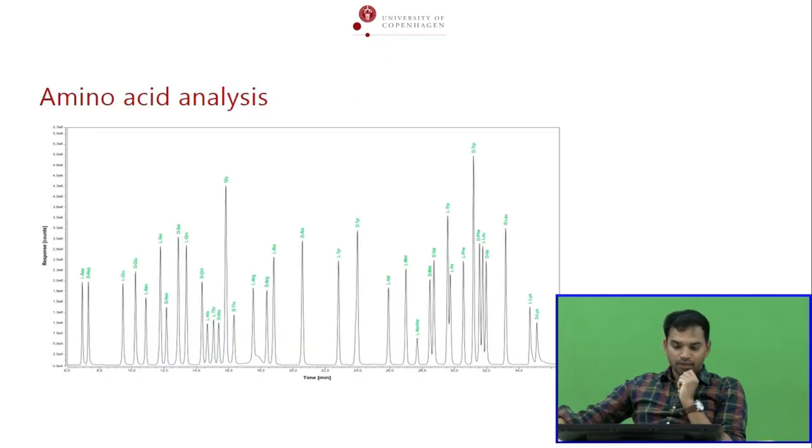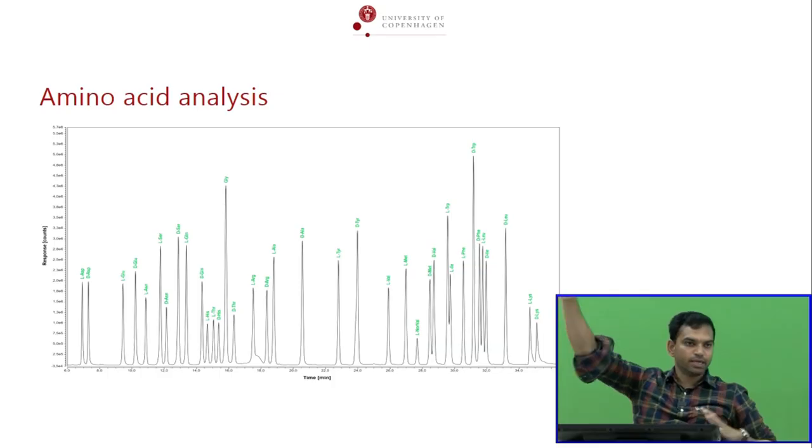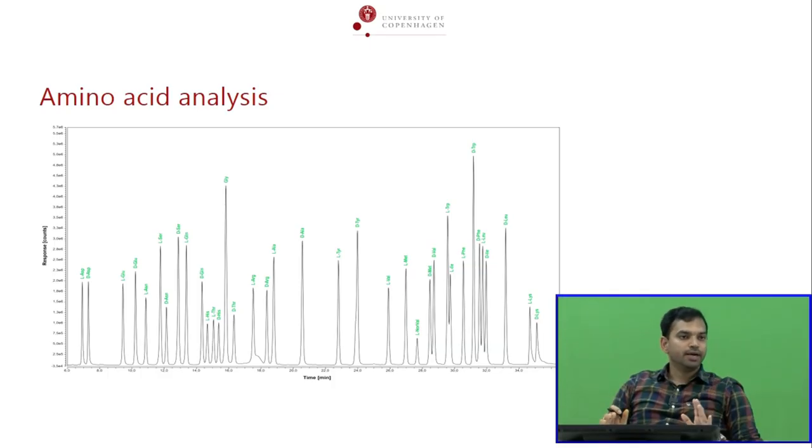Napin, right? We can also use HPLC to separate amino acids. After hydrolyzing the proteins, you can separate individually, you can identify and quantify the amount of amino acids. You remember in my first or second lessons, I talked about a lot of essential amino acids present, a lot of non-essential amino acids present. All of them were measured by either HPLC or GC.